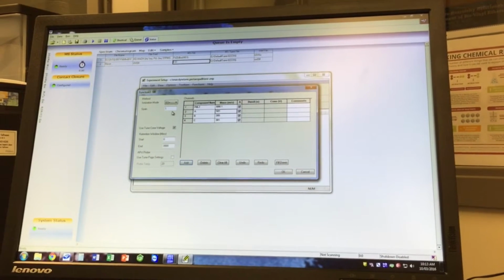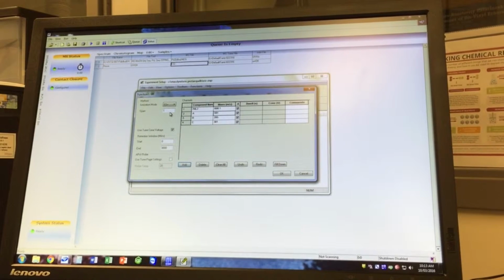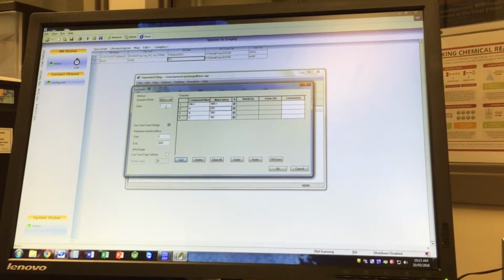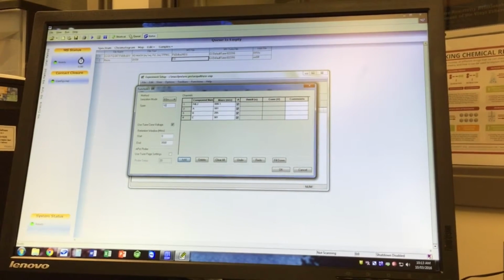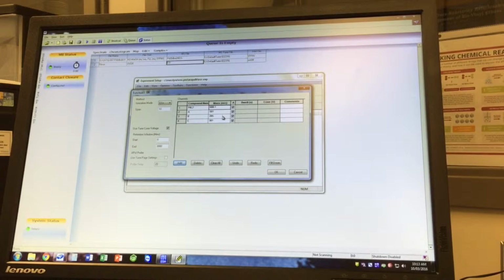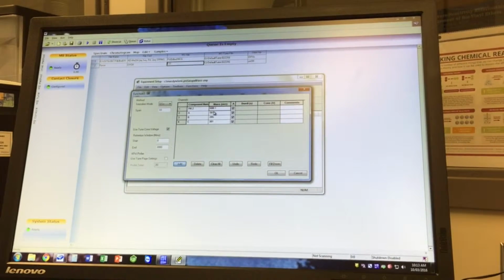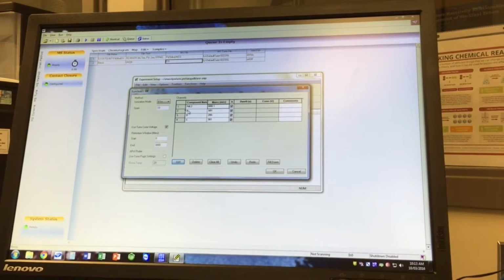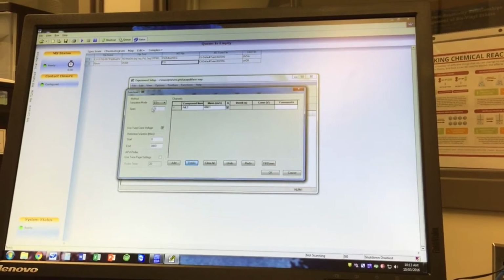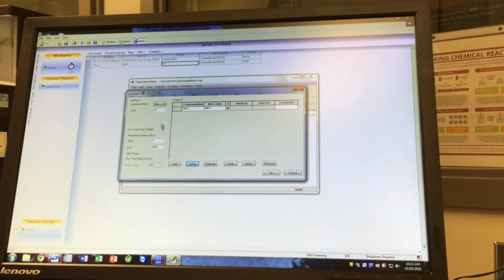But so if you have a metal in there with a lot of isotopes, you're going to want to cover all of that. If you had a metal with, say, 5 isotopes on either side, you'd probably want to set that span to 10. But remember that that's going to be for each one of these compounds. So if you wanted to do a span of 10 just for, say, your metal complex, you would want to get rid of these guys and make a separate SIR that has a smaller span, just for an example.